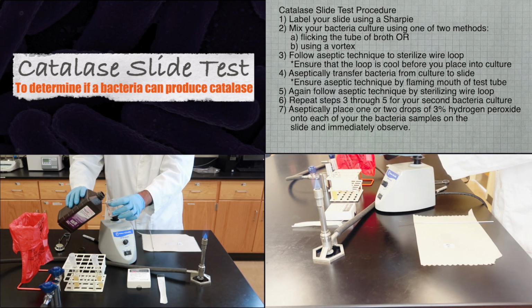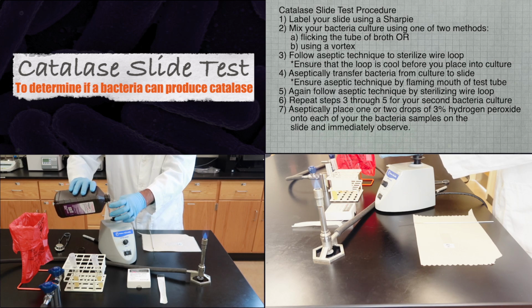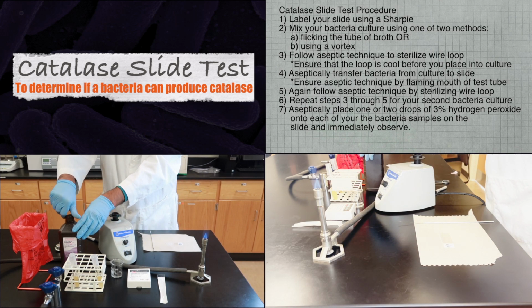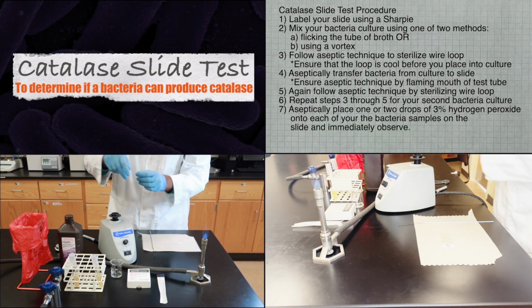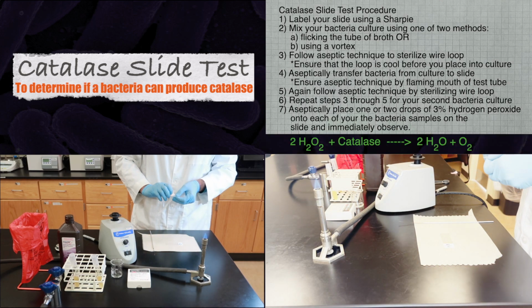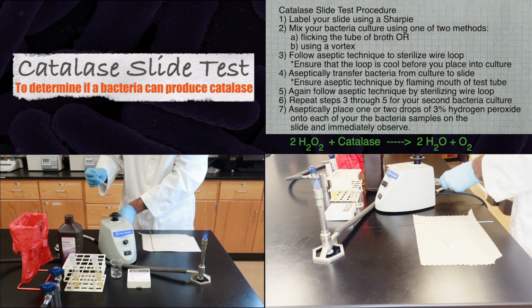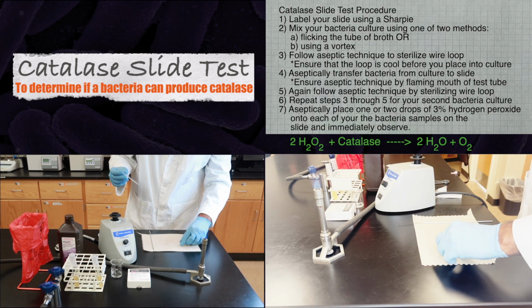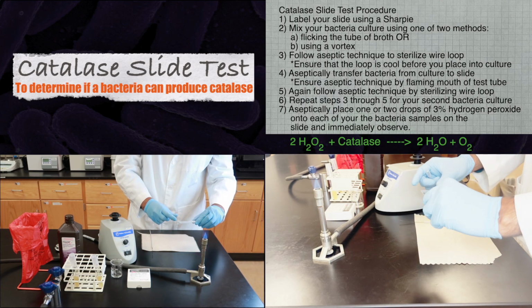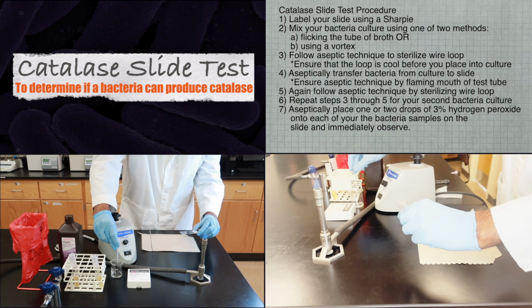Next, aseptically place 1 or 2 drops of 3% hydrogen peroxide onto each of your bacteria samples on the slide and immediately observe. Please note that when you observe, you will be looking for bubble formation, which will be due to oxygen gas that's released when catalase breaks down hydrogen peroxide into water and oxygen gas.